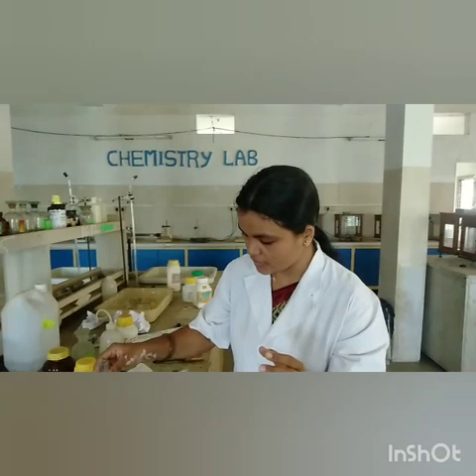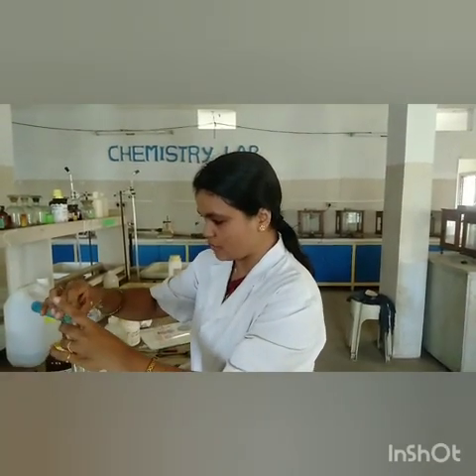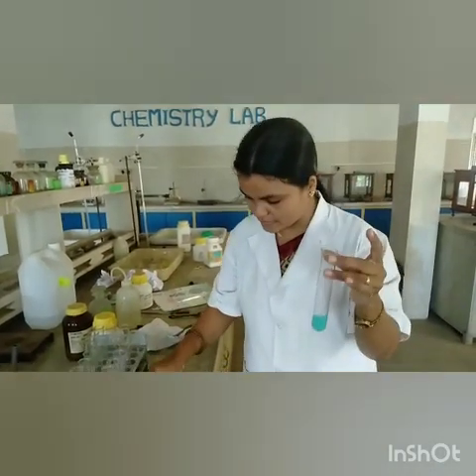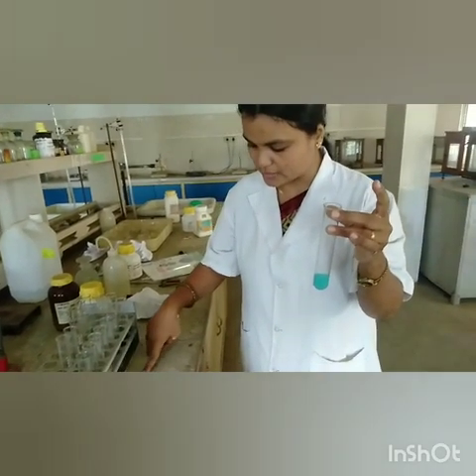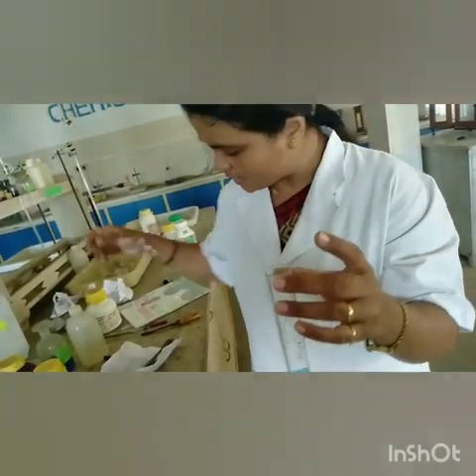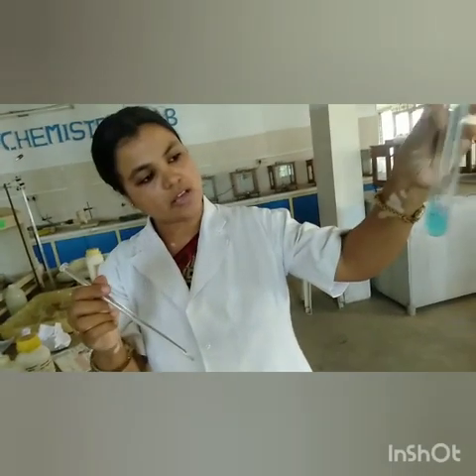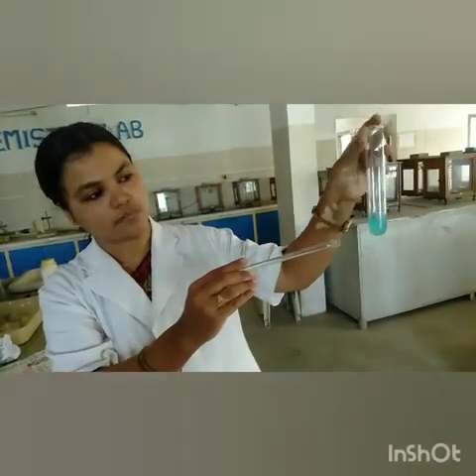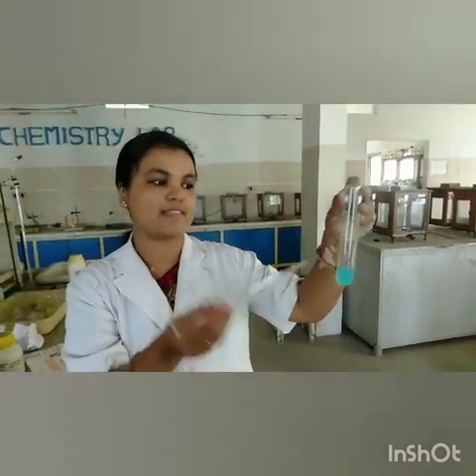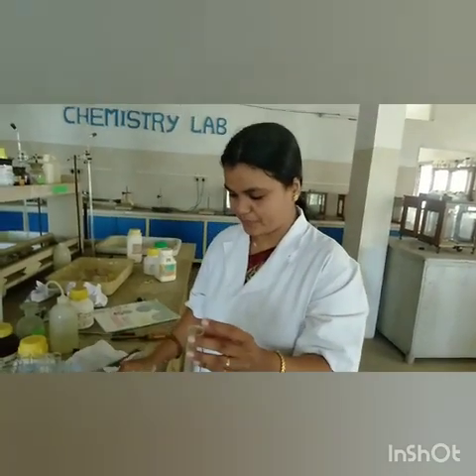Okay. Then the same thing if we mix it in copper sulfate solution. Here is the copper sulfate solution. I have taken a small amount of copper sulfate solution, and when I add these copper turnings to it, what will happen? You will see that no reaction ever happens because both are copper only, right? No reaction, no change at all. There is no change in the color of the copper sulfate solution. So we can say that, we'll tabulate all these observations and we'll find that.